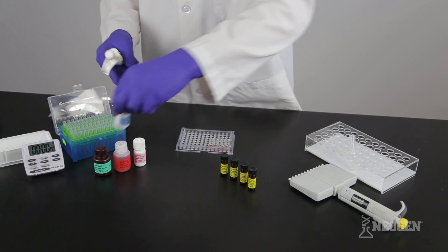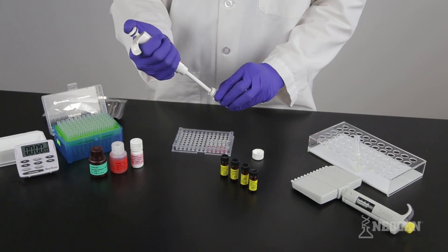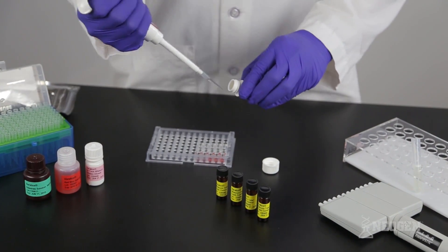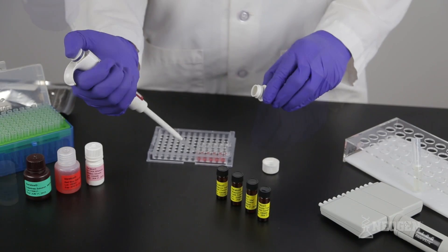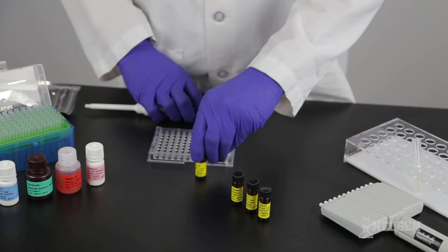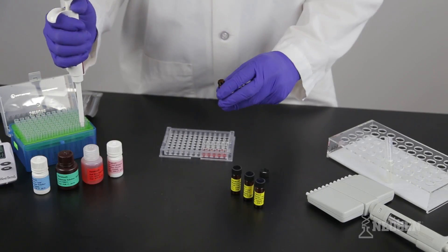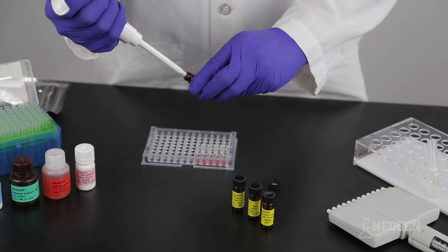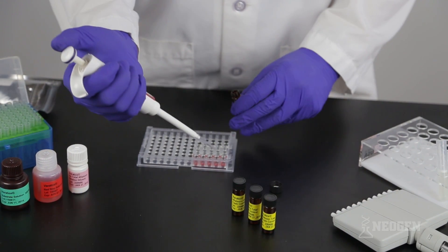Using the 100 microliter pipetter and a new tip, prime and pipette 100 microliters of conjugate into each red marked well. Gently swirl each reagent prior to use. Using a new pipette tip, prime and pipette 100 microliters of the zero control into the first red marked well.